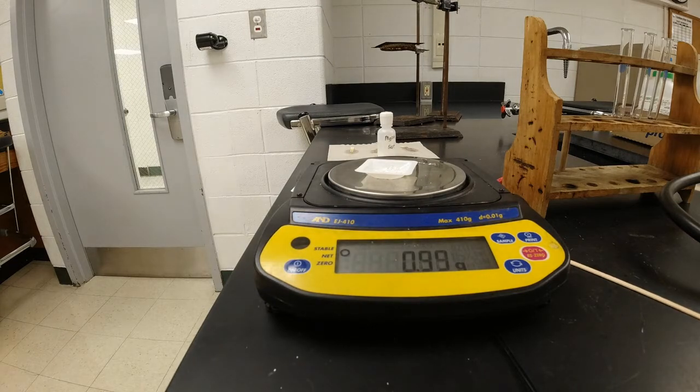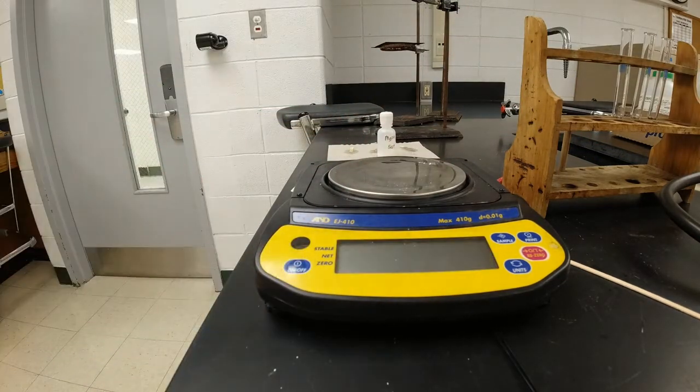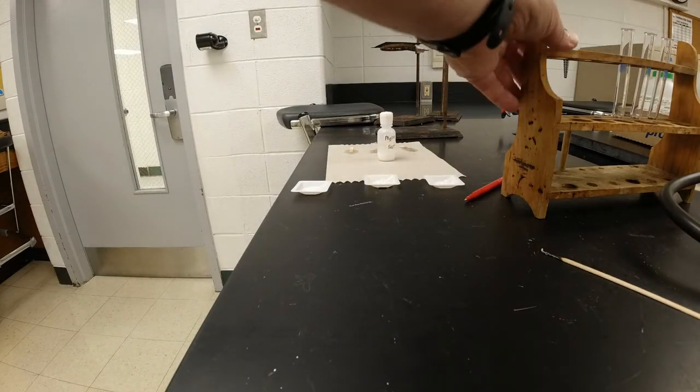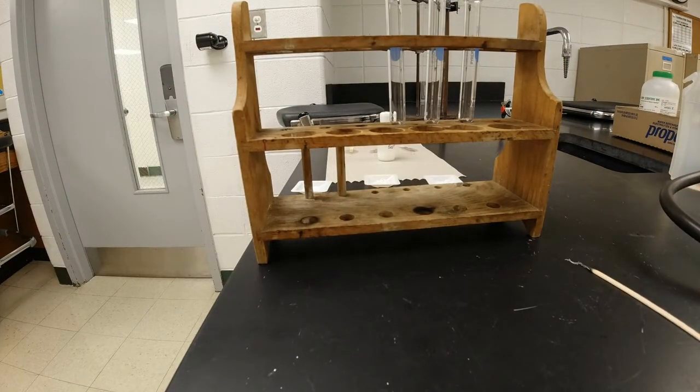Just a bit more. All right, so there's 1 gram of the barium sulfate. I'm done. And then what I'm going to do is I'm going to put those powders in each one of these test tubes here.